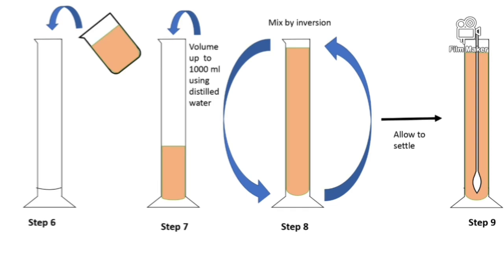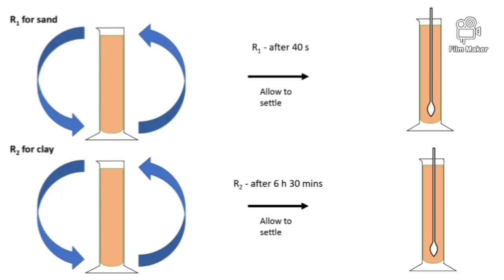Then cover the top of the cylinder using a parafilm and invert it. Allow the mixture to settle. After 40 seconds of settling time, take R1, the reading for sand. After 6 hours and 30 minutes of settling, take the second reading, R2, for clay.